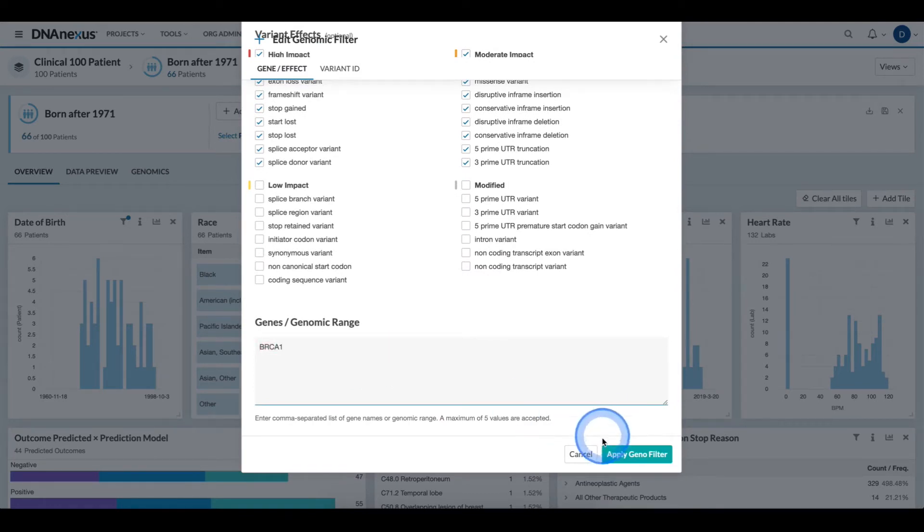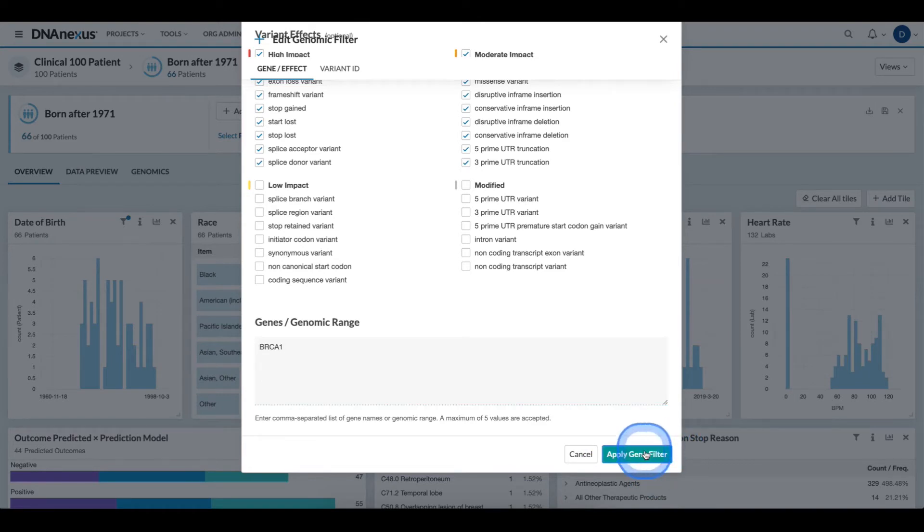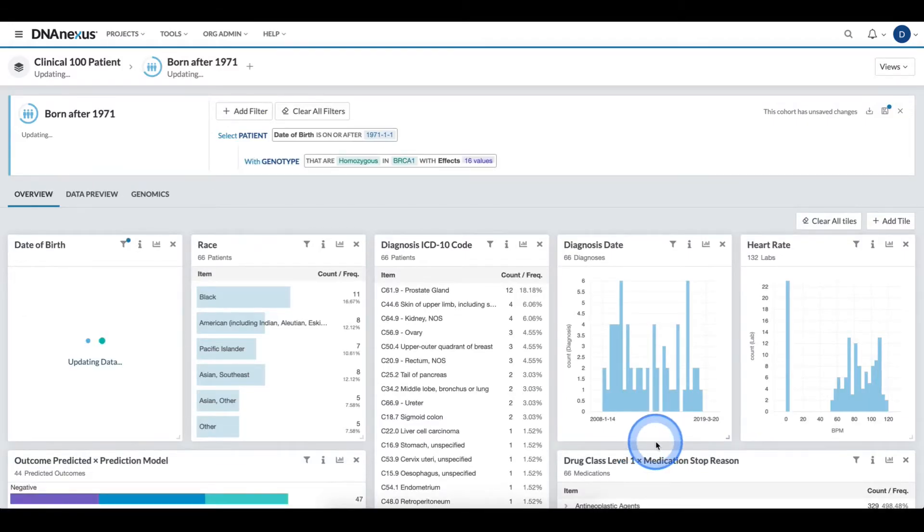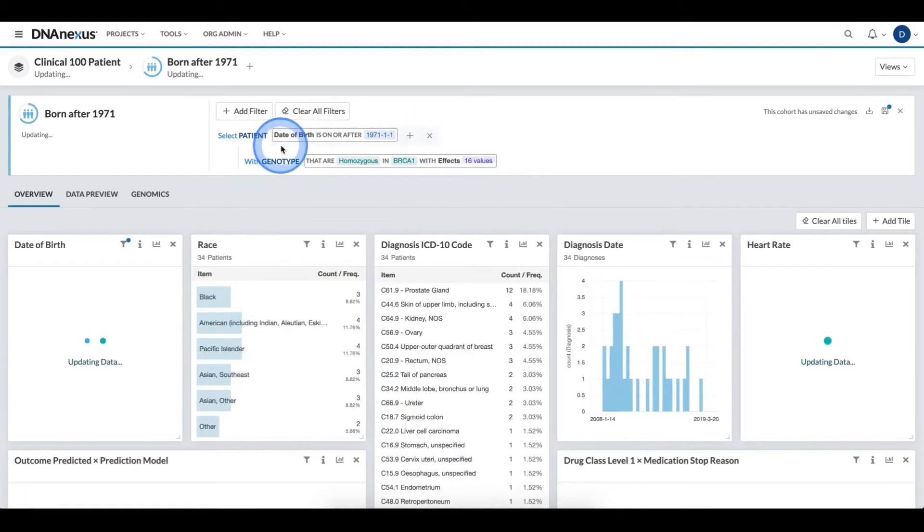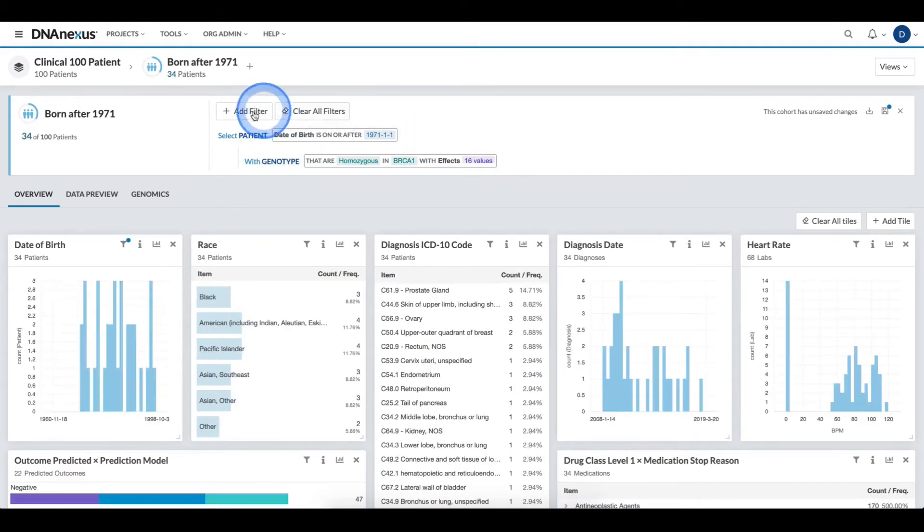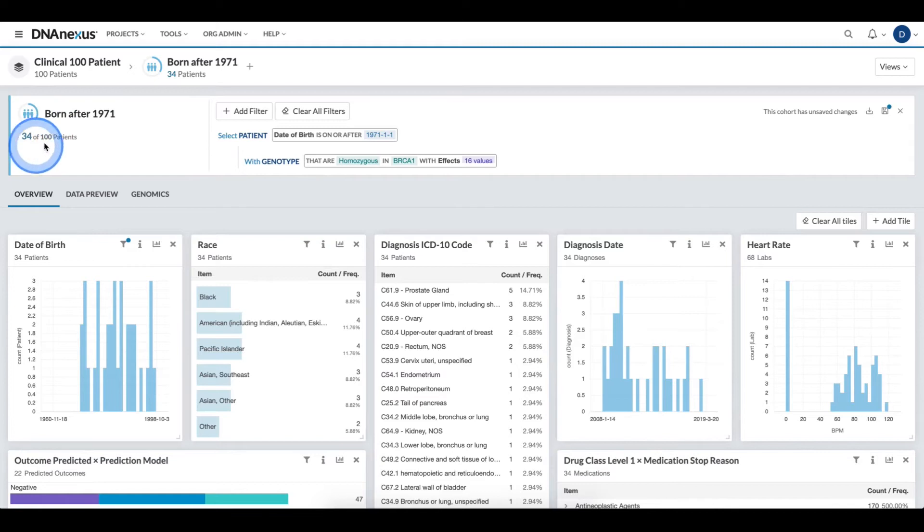Now that I'm ready to apply this filter, I click the Apply Gene filter, and this filter now gets applied to my cohort alongside the clinical filter and filters down to 34 patients.